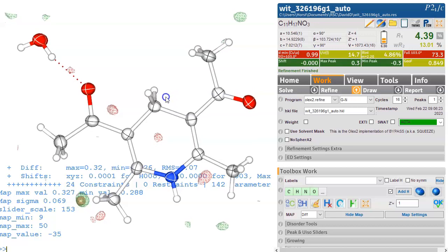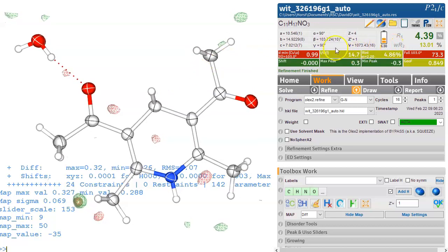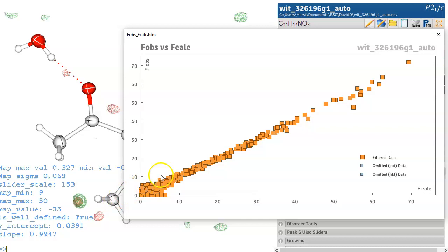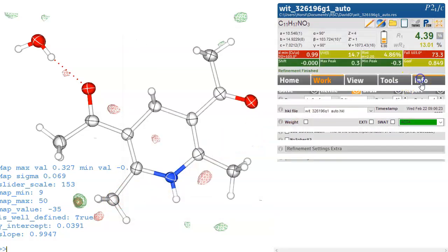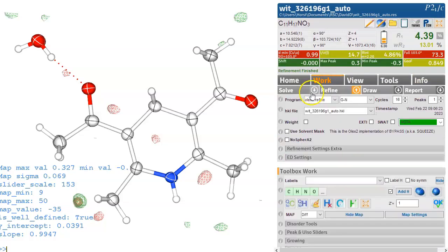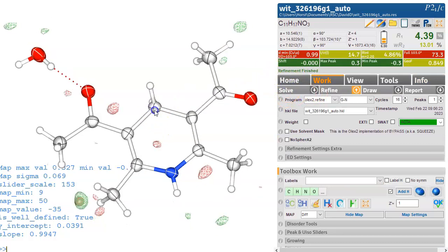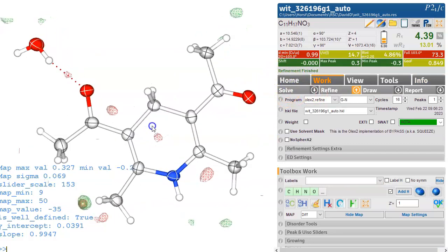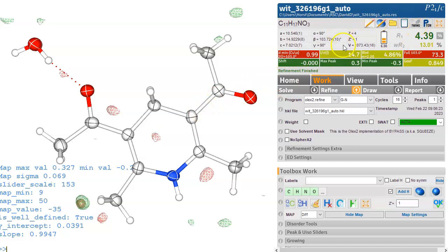Again control M just to check and that looks very very clean there's hardly anything left in this map so this looks like a very nice finished structure except of course this wouldn't be publishable that resolution isn't high enough and the completeness isn't high enough so let's look at that graph so we have some maybe outliers we can also look at info and bad reflections it doesn't really flag any outliers here.